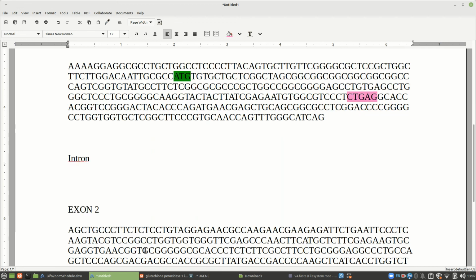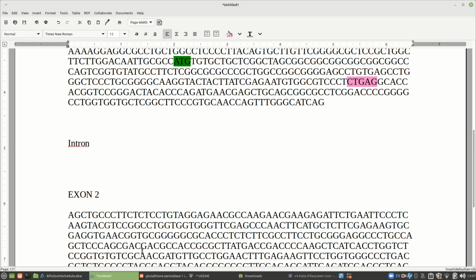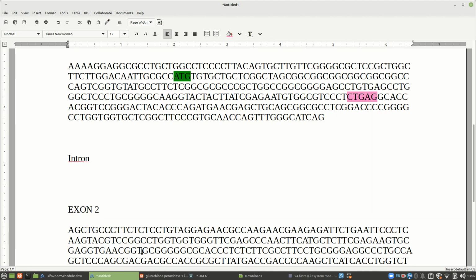If you can't find it, that's legitimate. Sometimes you just can't find these things. This is such a fuzzy art, and it's amazing that people just let the computer run through it with the rules and they expect to find the right answer. And people publish things, and it is just amazing. Now, this is useful because without doing what we're doing right here, you are going to do ten times the amount of lab work to actually figure out what's going on.